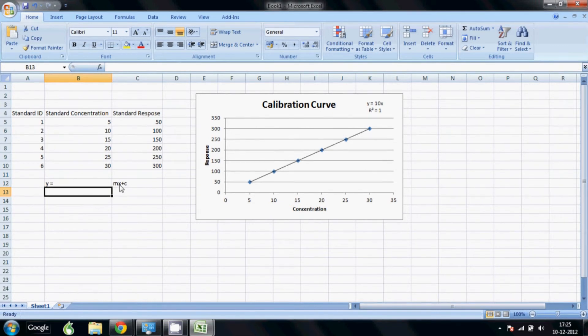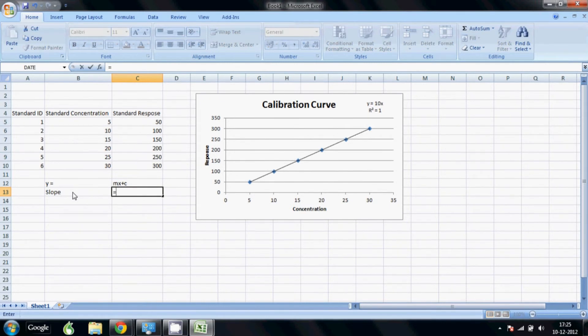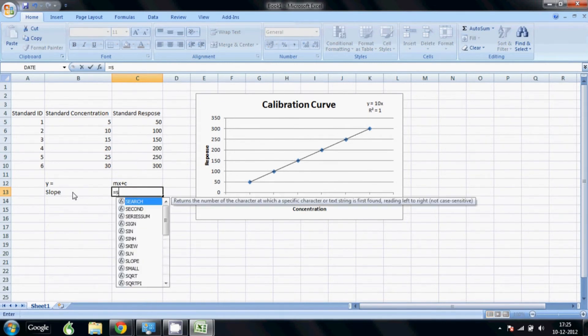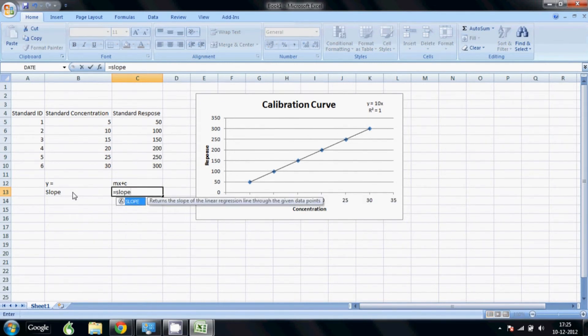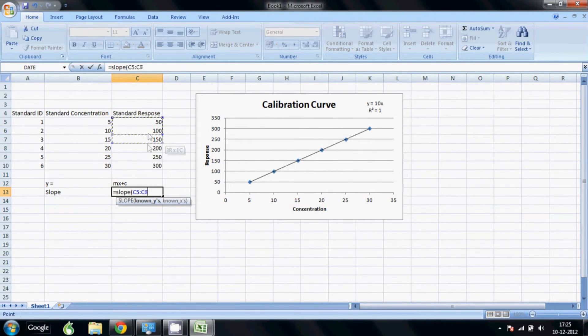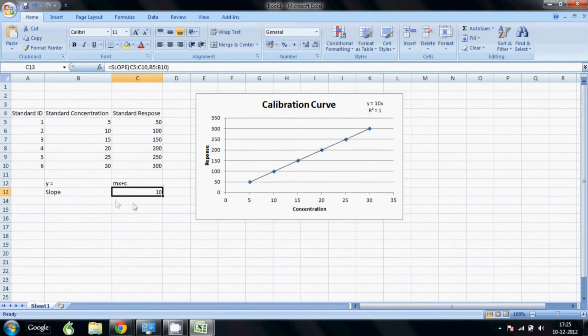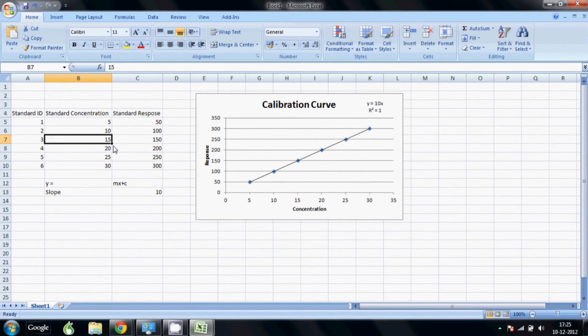So let's put the formula for slope. We first label it slope and here we go and we click equal to and you start typing s-l-o-p-e. So you see it gives you that slope returns the slope of the linear regression. So now we click add a bracket. It says known y's and known x's. So we have our response on the y axis here, you can see it's on the y axis. We add a comma and we put our known x's and enter. So we get our slope. So you see the slope value in the equation and here is same.